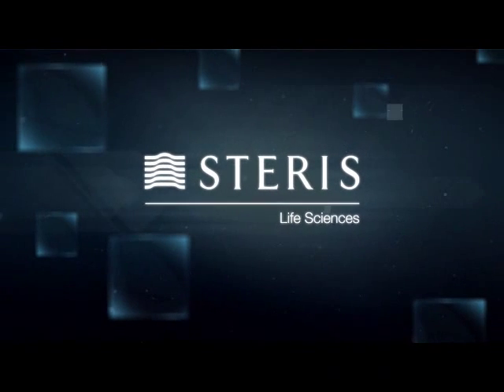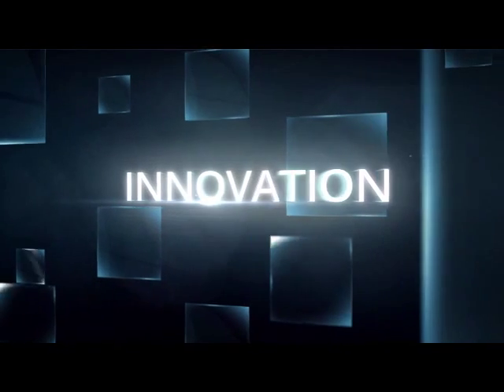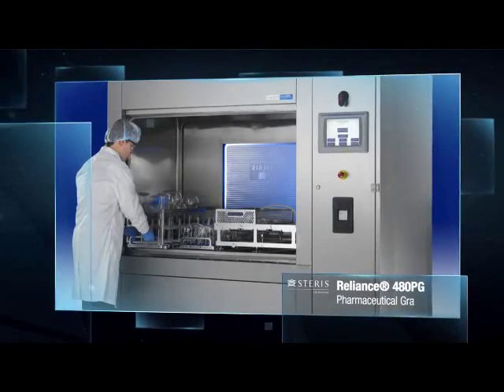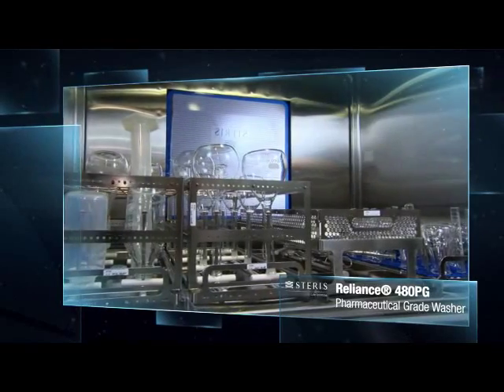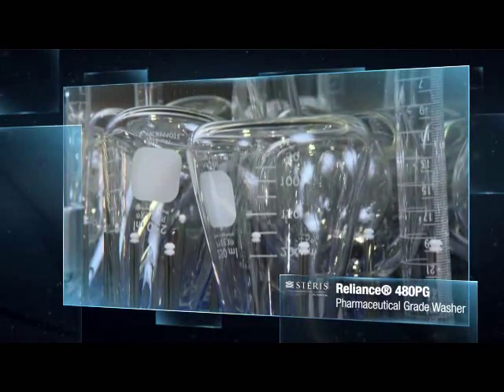Introducing a new high performance parts cleaning system from Steris. The Reliance 480PG pharmaceutical grade washer was designed to clean critical components commonly used in pharmaceutical manufacturing, such as filling line and packaging machine parts.